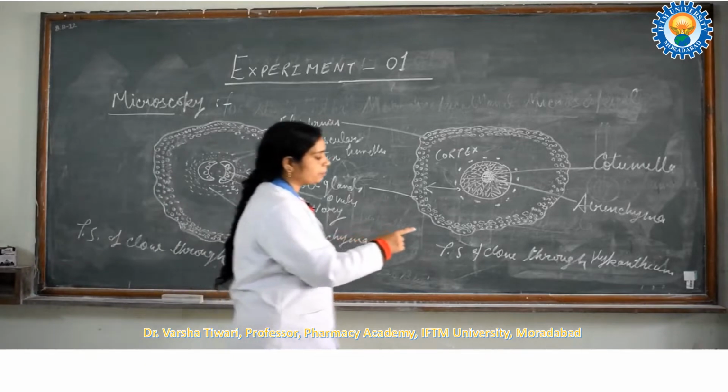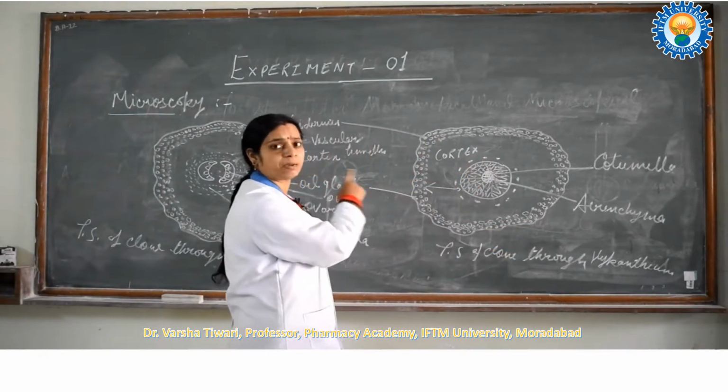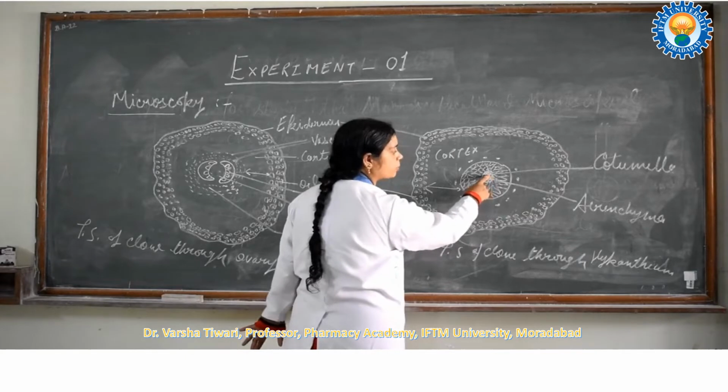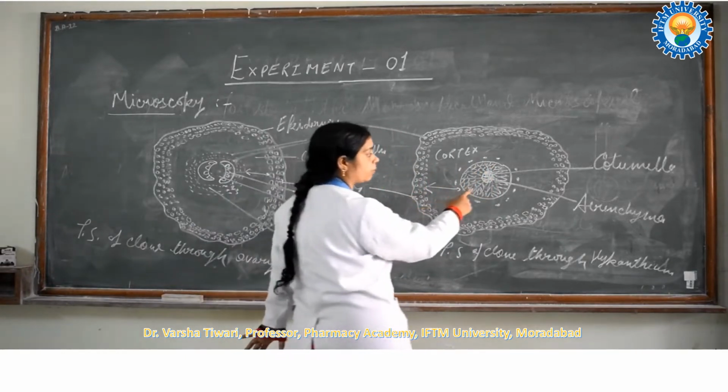When we study the section through the hypanthium, there is a little difference between the section through the ovary and the hypanthium. In the hypanthium region section, you are going to observe a blank central region. You are not going to observe the ovary here.